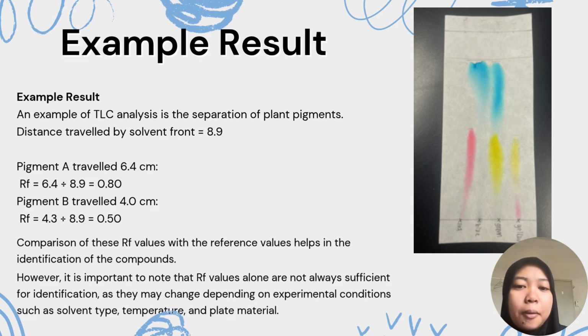However, it is important to note that Rf values alone are not always sufficient for identification, as they might change depending on experimental conditions such as solvent type, temperature, and plate material.